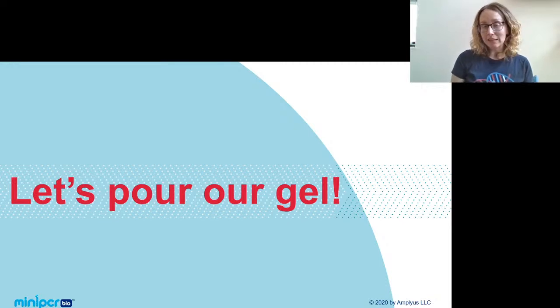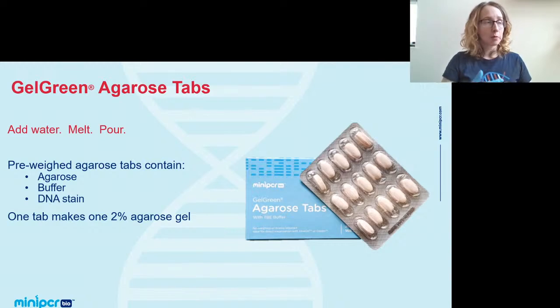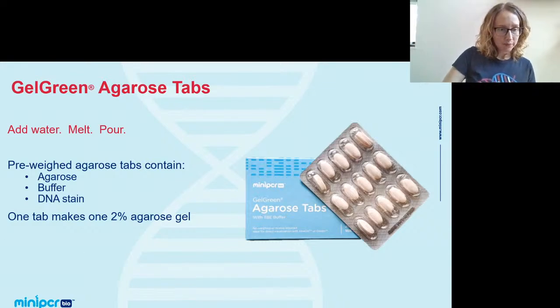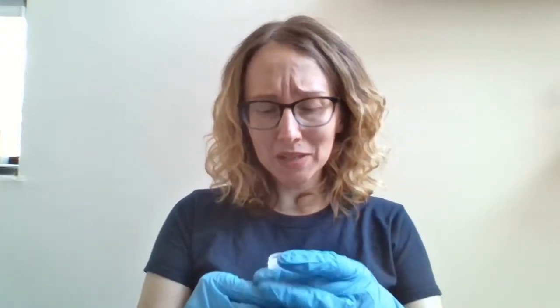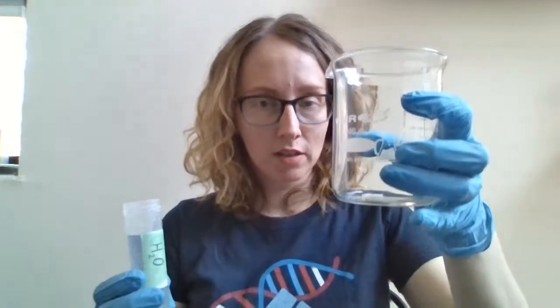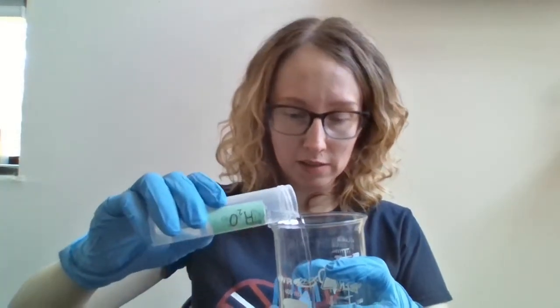This is a mini PCR product. The basic idea is it's a tab of pre-measured agarose, and it's already mixed with buffer, and it's already mixed with DNA stain. So you simply need to add water to this, pour your gel, and then that's it. It saves you a little bit of time with the measurement steps. So let's see. Here is my gel green tab. I have it all set up in my beaker here, and all I need to do is add water. I'm using a 2% gel for our experiment today, and so that means I need to add 20 milliliters of water to this tab. So I'm using this falcon tube, kind of like a graduated cylinder.